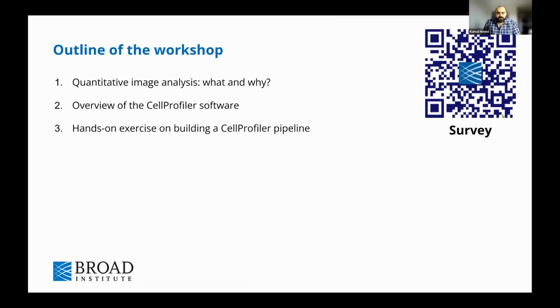So the outline for today's workshop is I'll start off with a gentle introduction about quantitative image analysis, the what and the why, and then I will transition into the overview of the CellProfiler software, where I will hand over to Le, who will continue to get into more detail about how the software works. And afterwards, we move on to breakout rooms where we have the hands-on exercise for building a beginner segmentation pipeline.